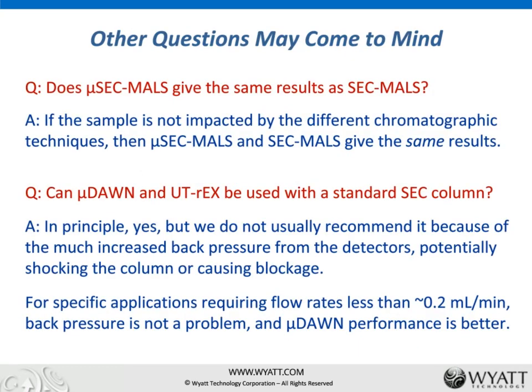Before I conclude, I also would like to share a couple questions asked by our customers. Does µSEC-MALS give the same results as SEC-MALS? Well, if the sample is not affected by the different chromatography separations, then they should give the same result.